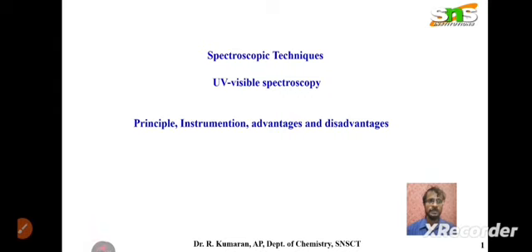Good morning everybody. In this video we are going to see about spectroscopic techniques, especially UV visible spectroscopy. In UV visible spectroscopy we are going to see about its principle, instrumentation, advantages and disadvantages of using UV visible spectroscopy.